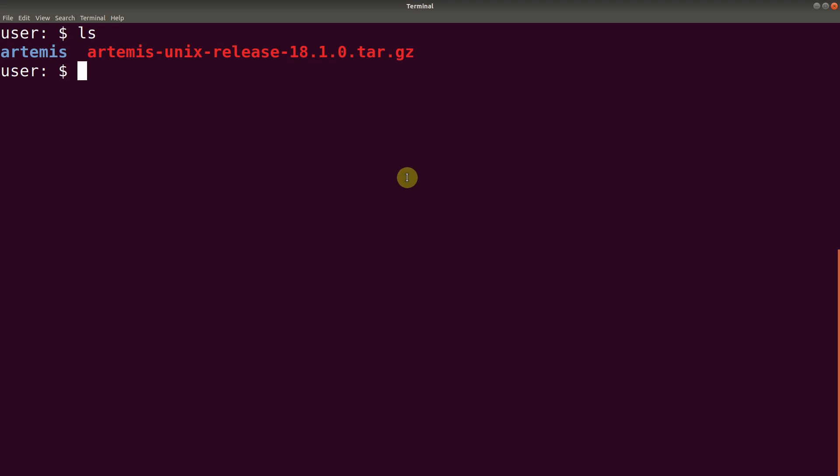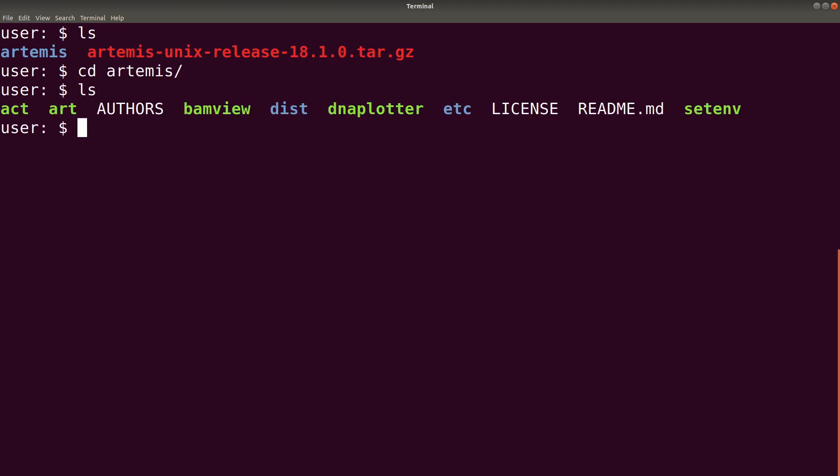Again, I repeat. In order to run the binary files, you need to make sure you have Java installed. So we can navigate to that directory. When you do an ls, you'll find the binary files there.